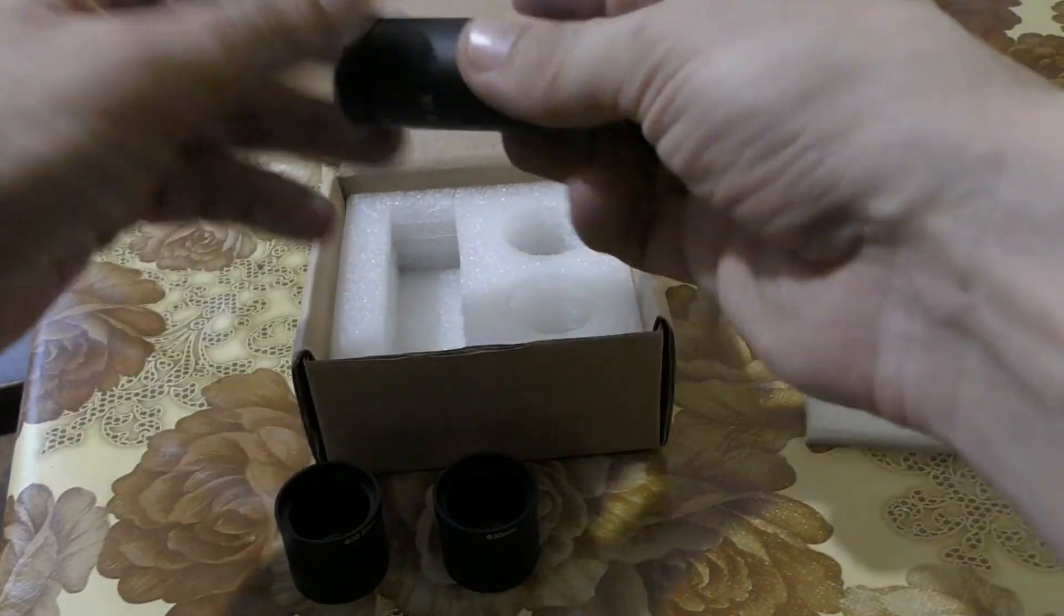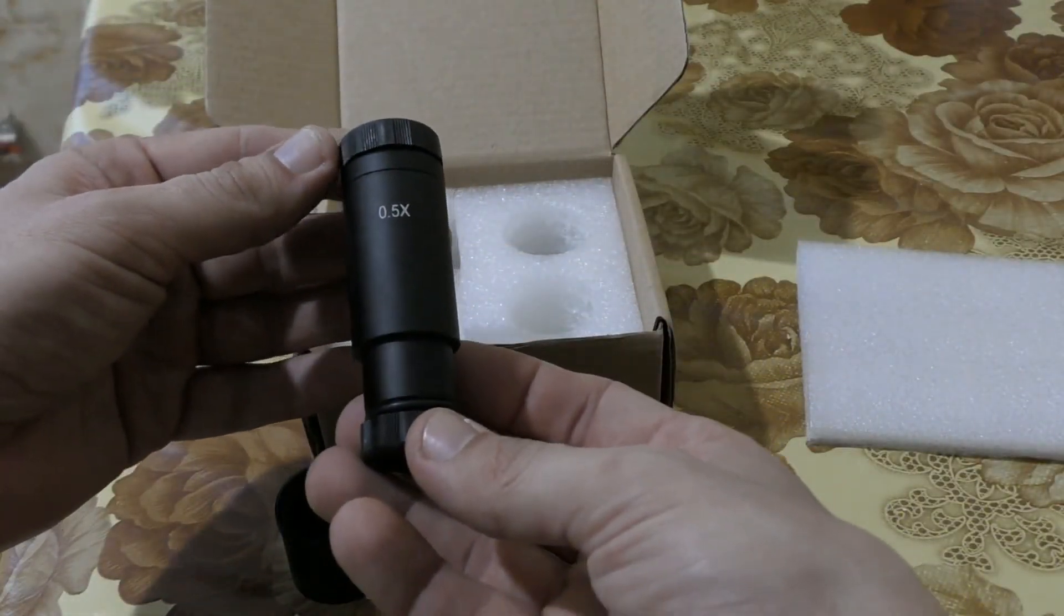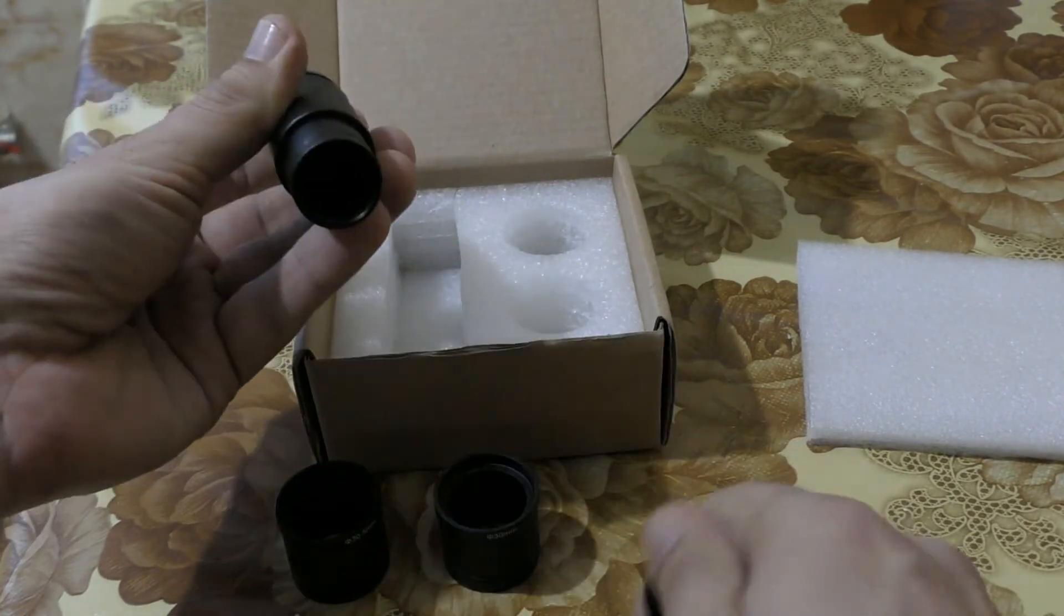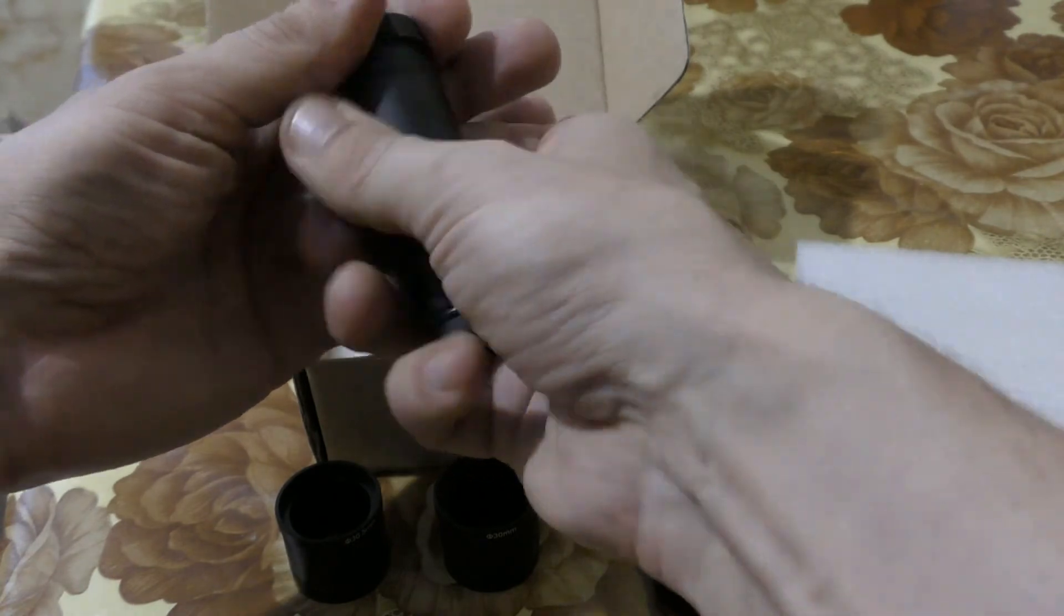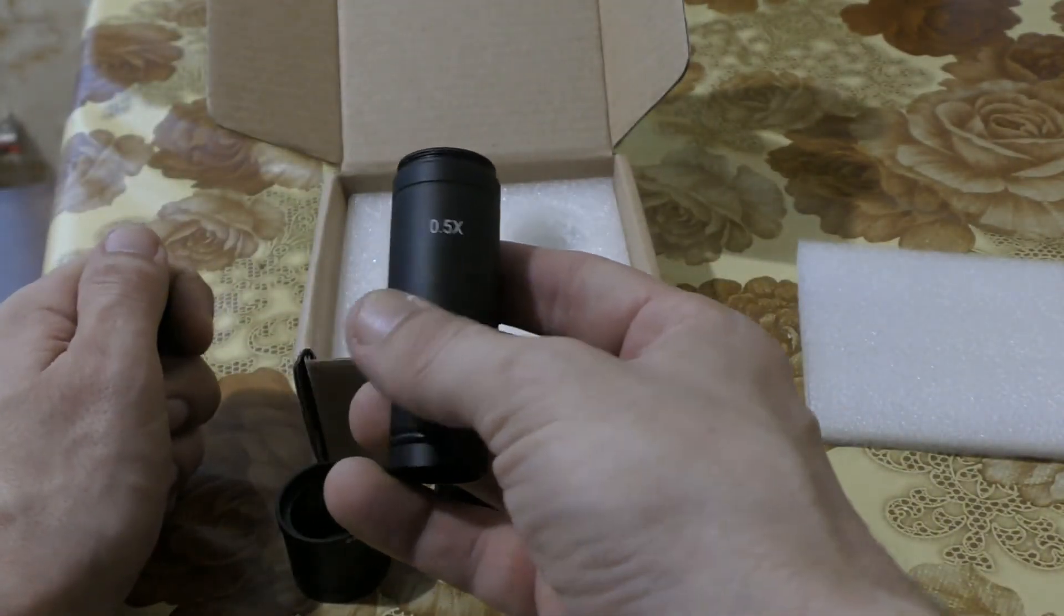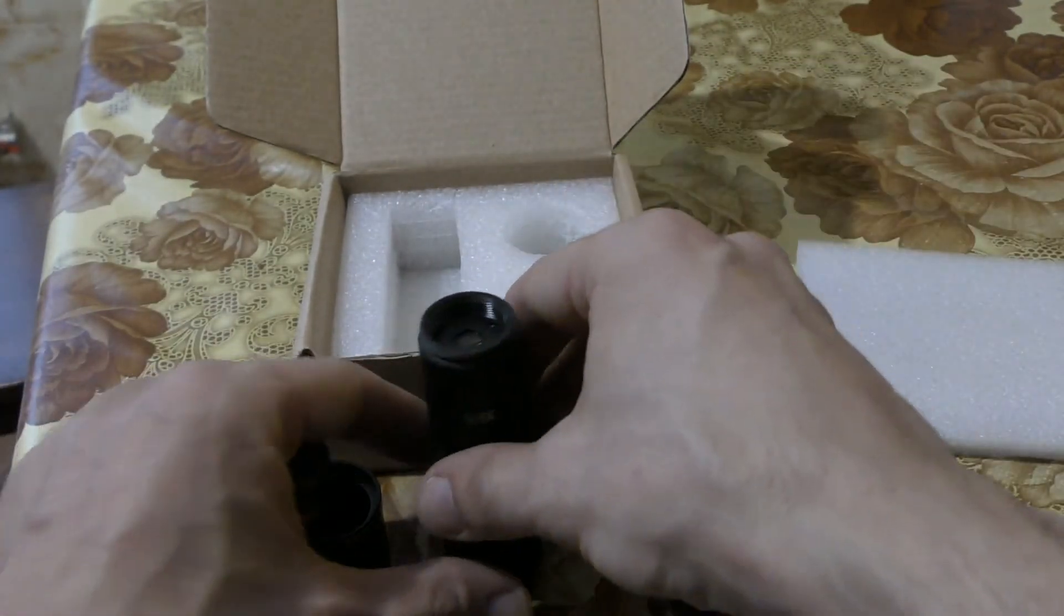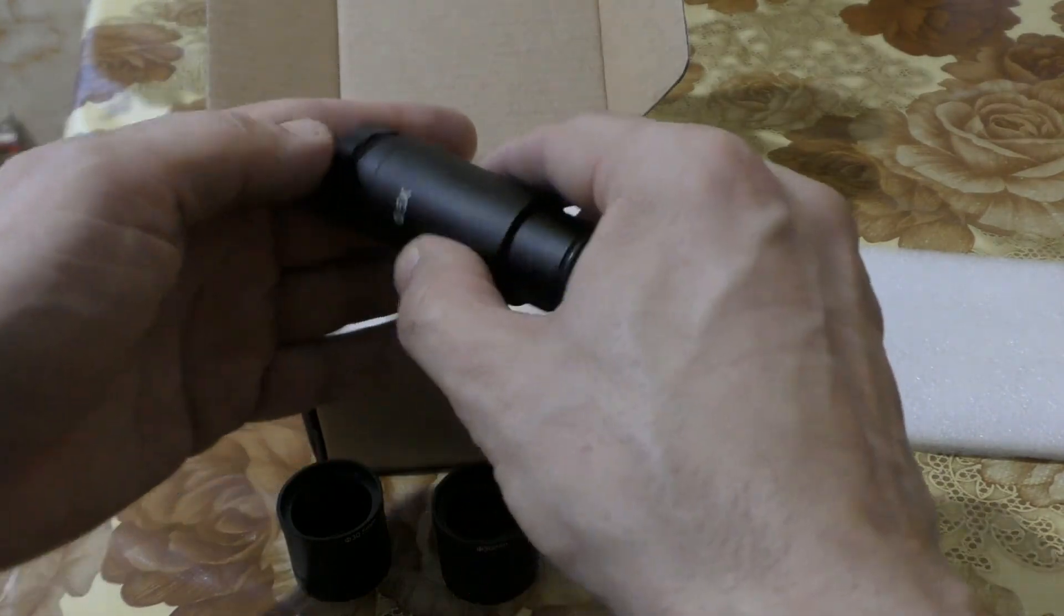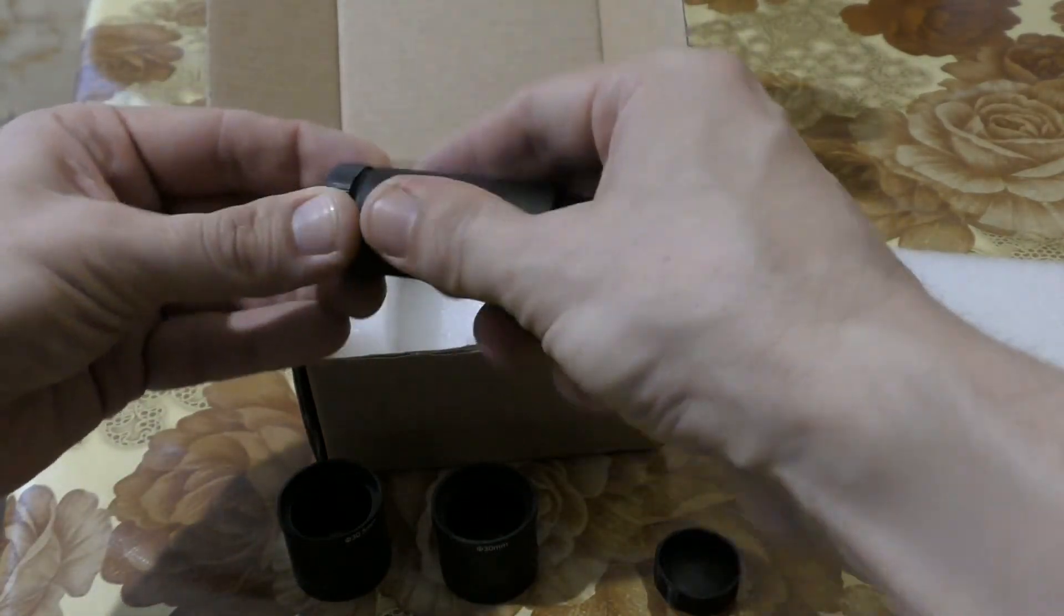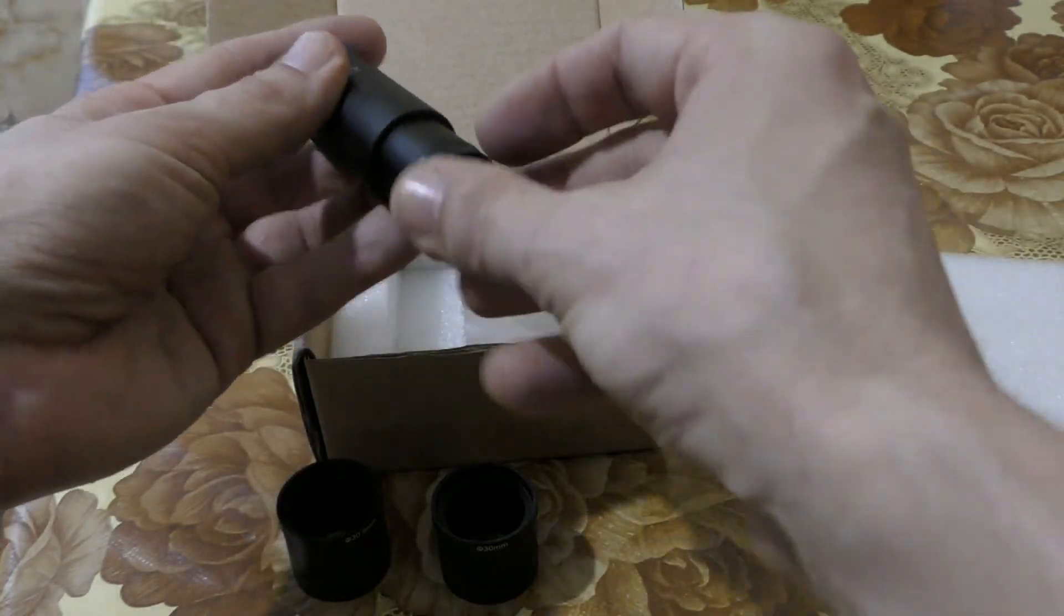And the optical part with several lenses and magnification 0.5x. It only just arrived, so I won't use it right now, but of course I will show how it works, and you will see it.